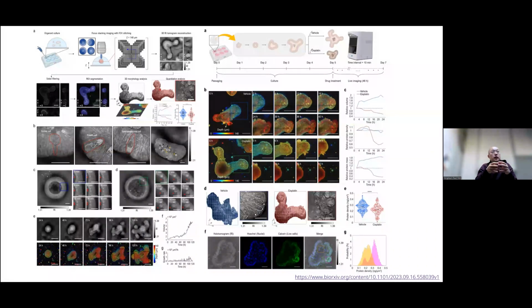They were studying the growth of small intestinal organoids in response to target drugs for cancer therapies, and they were observing individual cells such as goblet cells and Paneth cells, and also observed mitosis and apoptosis, and tracked the volume and mass of the individual cells and the total organoids.